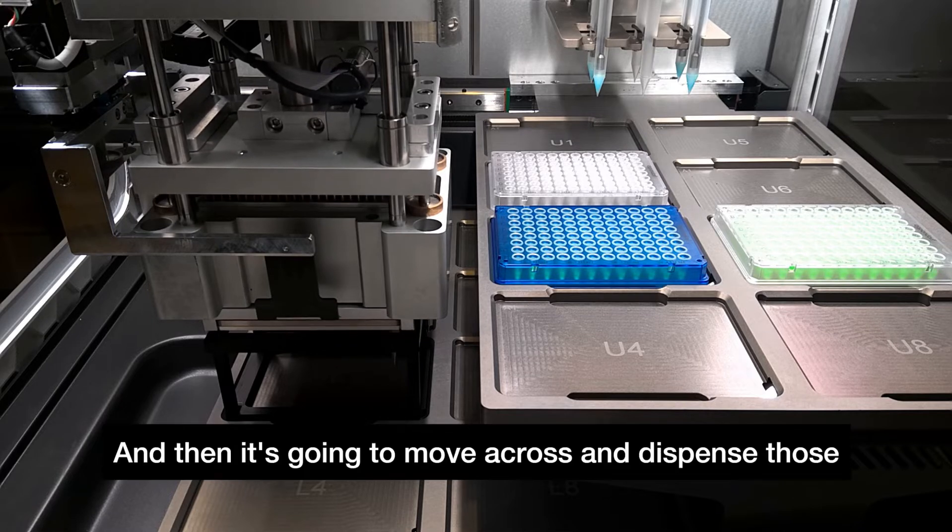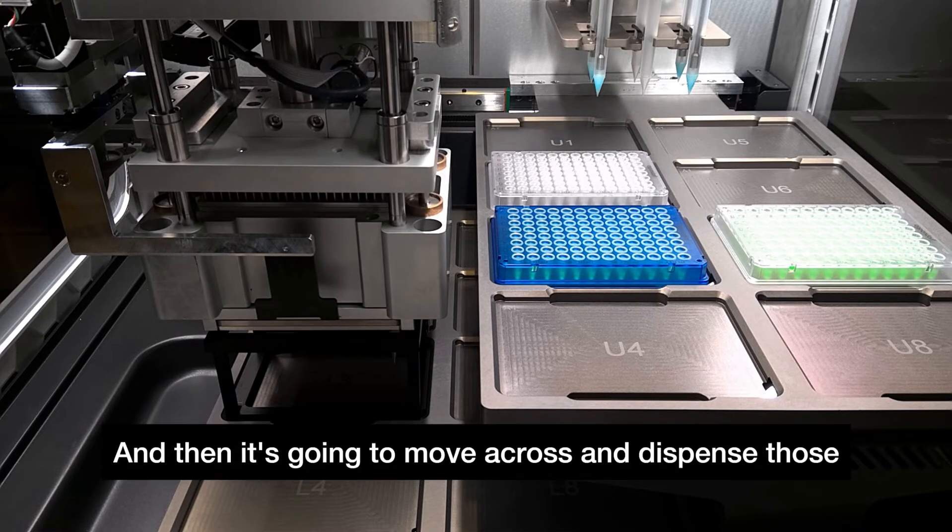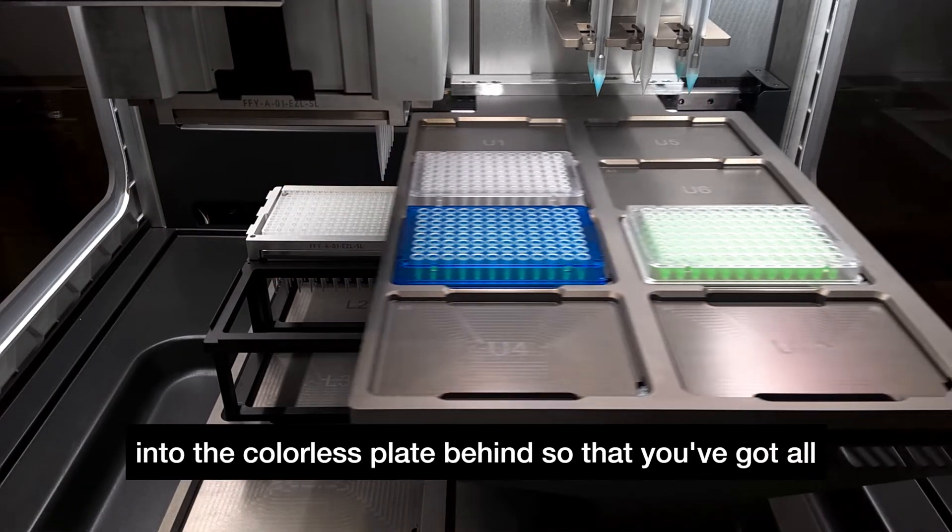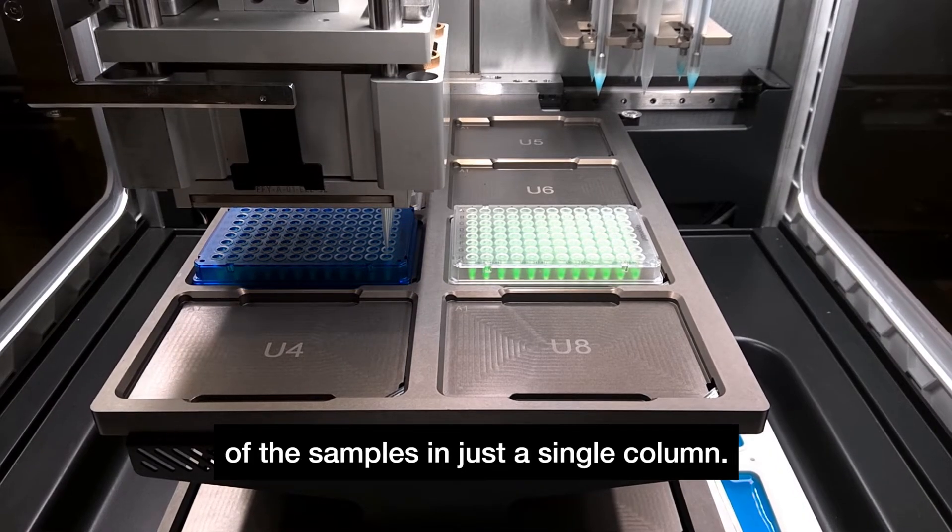Then it's going to move across and dispense those into the colorless plate behind so that you've got all of the samples in just a single column.